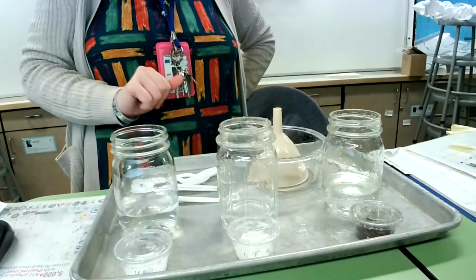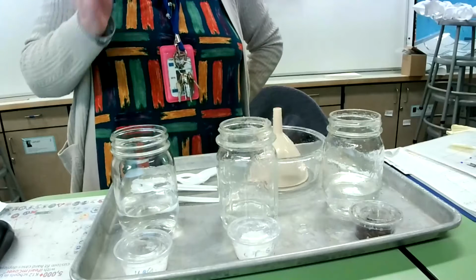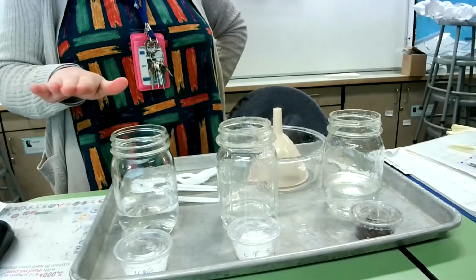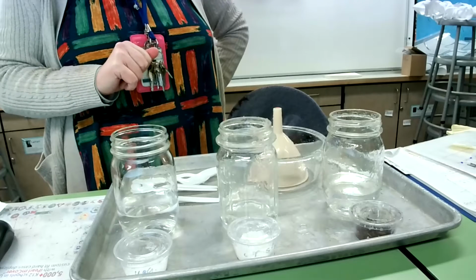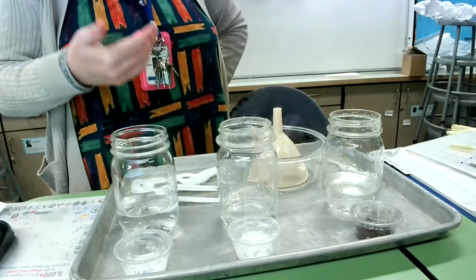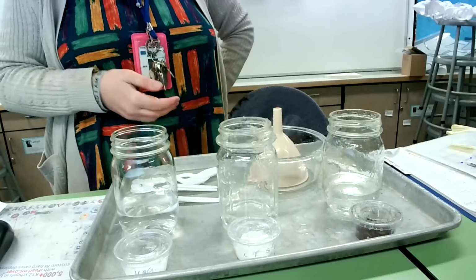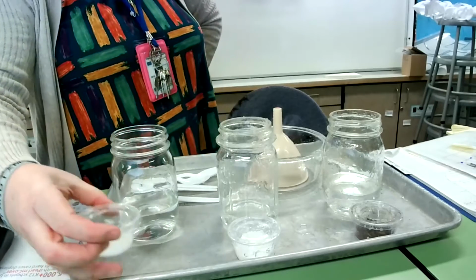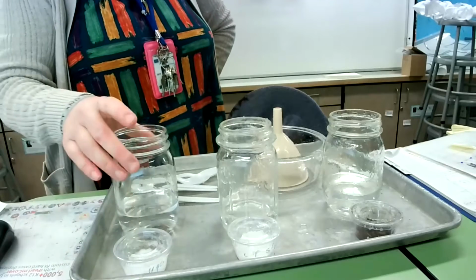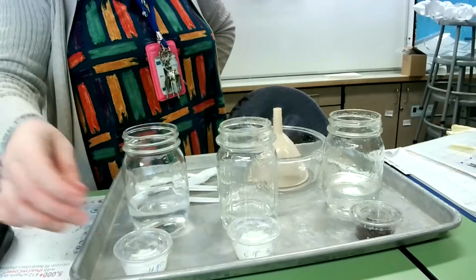So when you're checking for solubility, a soluble substance is one that when we add it to a liquid, we can stir and it dissolves and you don't see it anymore. If it's insoluble, that means we can mix as long as we want and we can still see that the substance is actually not dissolving into the liquid, okay? So what we're putting in is called the solute, and the solvent would be, in this case, the water that's in the jar. Okay, that's what it's being dissolved into.